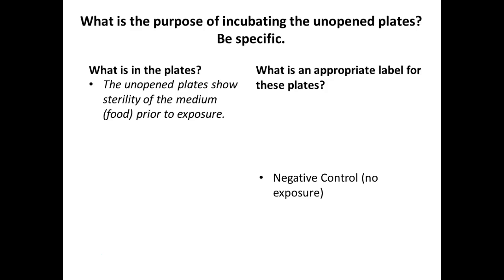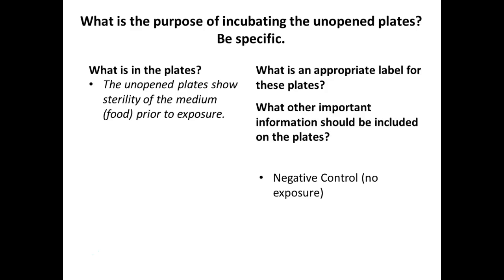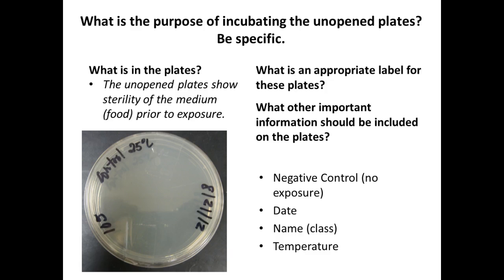What else do we label on our plates? What temperature we're going to store it at? I'm waiting for you guys. What do we put on those plates? We put the temperature, the date, the class or name, right? Where do we label the plates? On the bottom, where the food is.